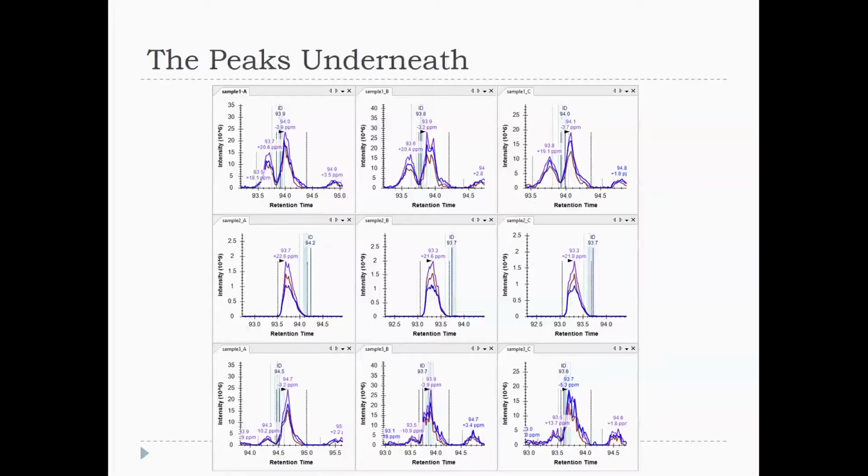But when I was in South Africa, just in December, somebody offered a beautiful example of this interference landscape that I had taught her in Barcelona, and there were 2 peaks. There were basically 3 peaks, and she did a knockdown experiment and said, voila, you can see that that peptide is gone because the 2 peaks stayed and there was nothing in the middle, right? So the interference landscape can give you reference points, and especially if you're doing manual integration and this just sort of went to nothing, you would go, oh, well, I still know where it is.